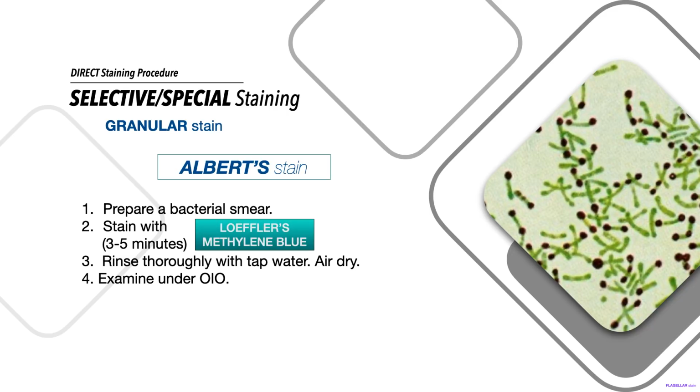Okay, that's why your Loeffler's methylene blue is otherwise known as a metachromatic stain, because it produces a metachromatic effect on our bacterial smear.